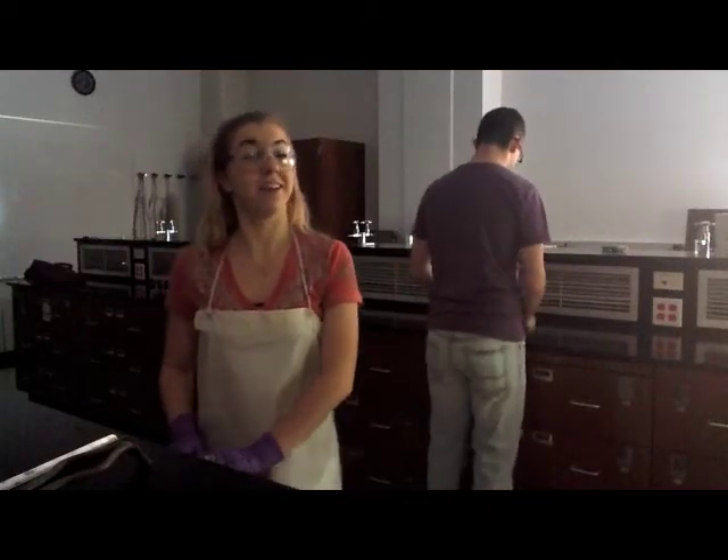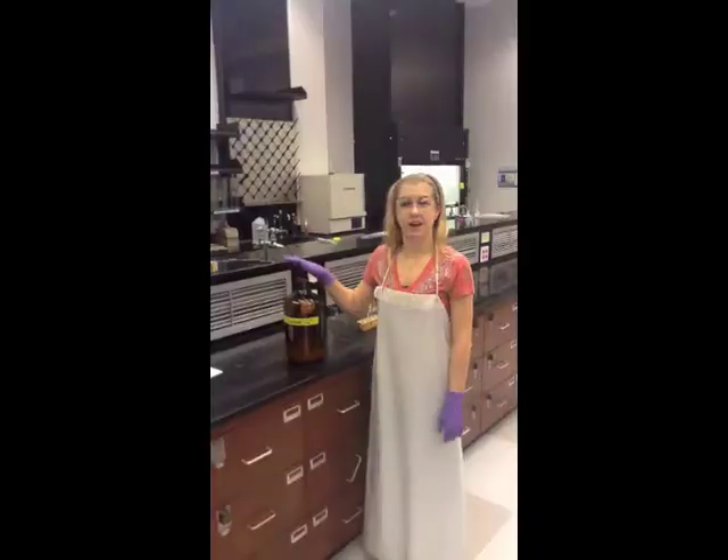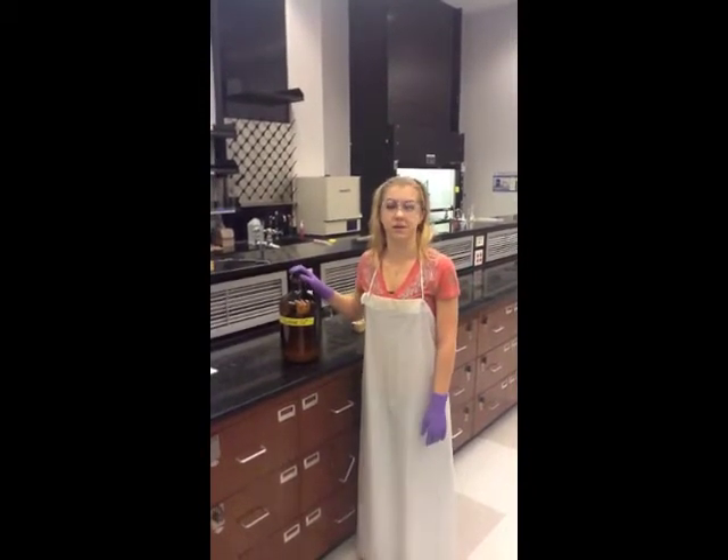The lights will likely be turned off during your experiment so you can see when the Luminol reacts, so take extra special caution when performing the experiment, being careful not to run into each other. Also take note that the toxicity of Luminol is not well known, so try not to spill it anywhere.